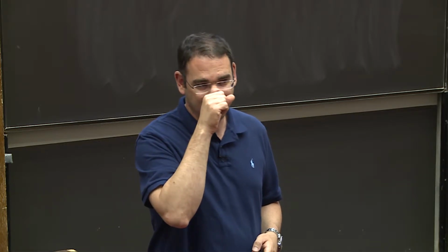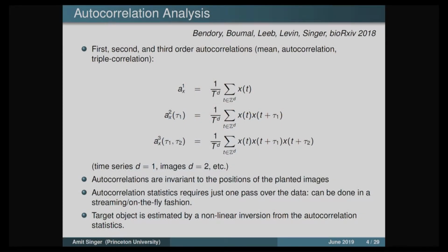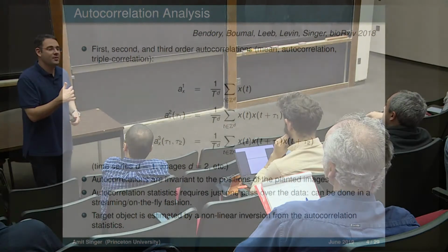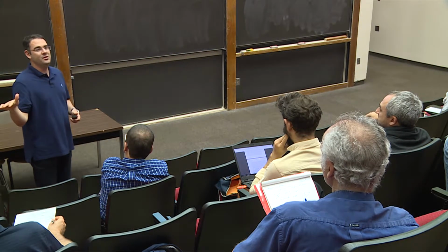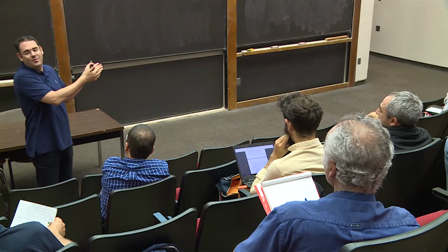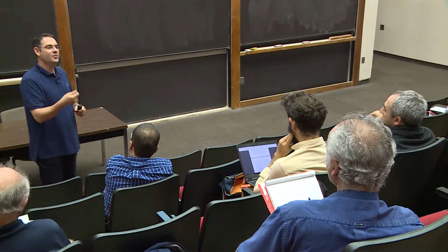May I just say, the crucial issue here is that with noise, we know everything about it: we know that the average is zero, we know the autocorrelation. So the outlier is with respect to a background for which we know everything. The statistics of the micrograph are going to look different from the statistics of white noise images. That's the whole basis of autocorrelation. But if you just try to do detection, you will not be able to do that.